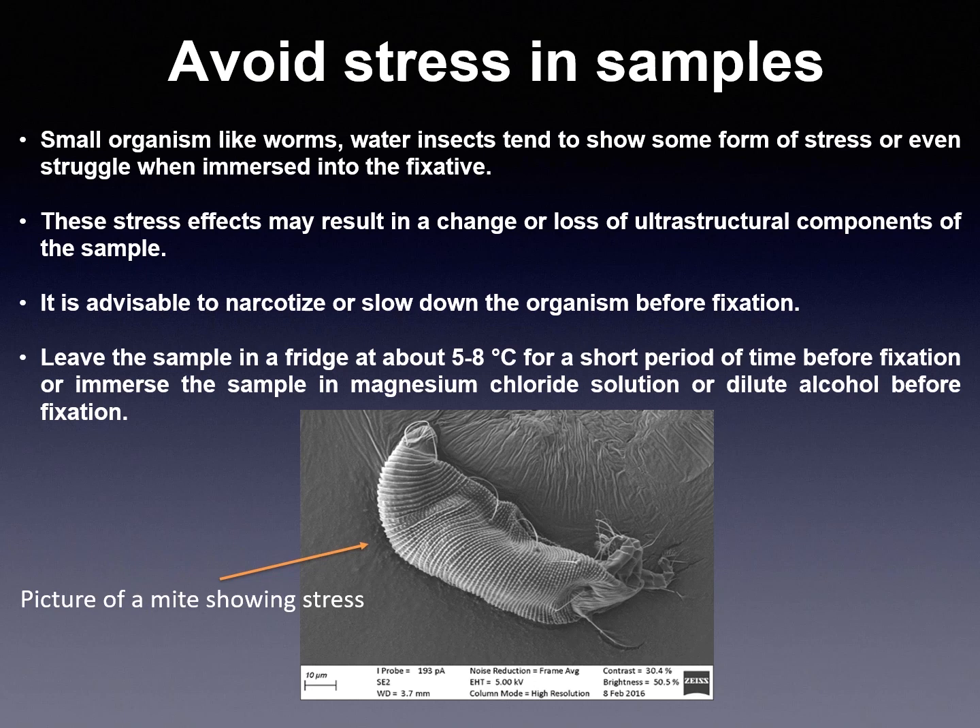Avoid stress in samples. Small organisms like worms, water insects and zooplankton tend to show some form of stress or even struggle when immersed in fixative. These stress effects may result in change or loss of ultrastructural components of the sample. It is advisable to narcotize or slow down the organism before fixation — leave the sample in the fridge at about 5 to 8 degrees for a short period, or immerse the sample in magnesium chloride solution or dilute alcohol before fixation. In the image, we can see a mite that has collapsed during the sample preparation protocol.